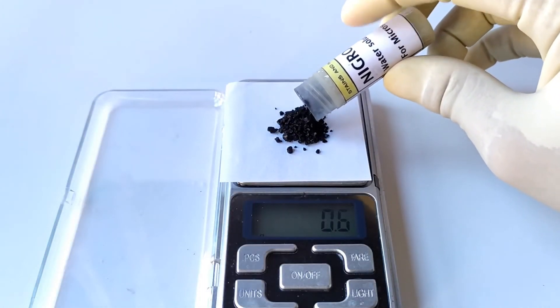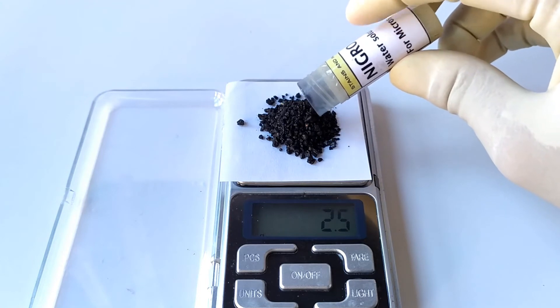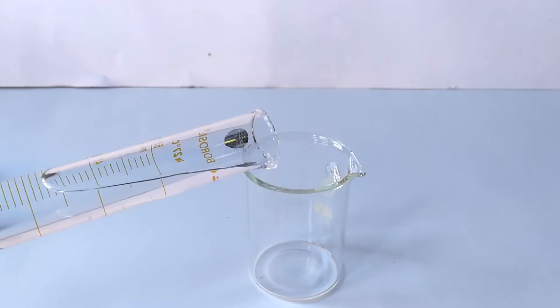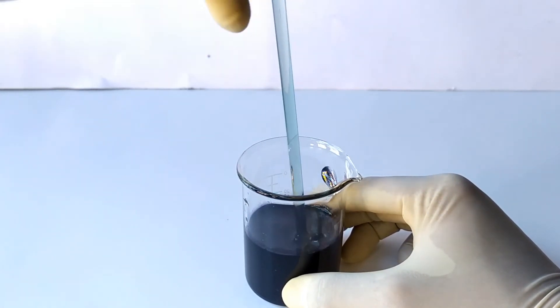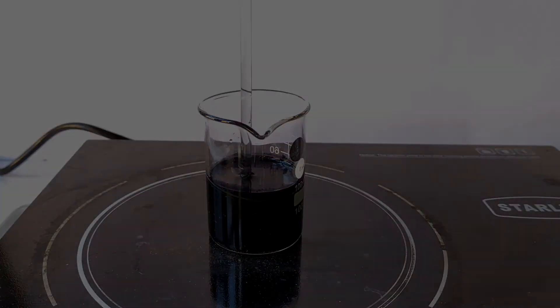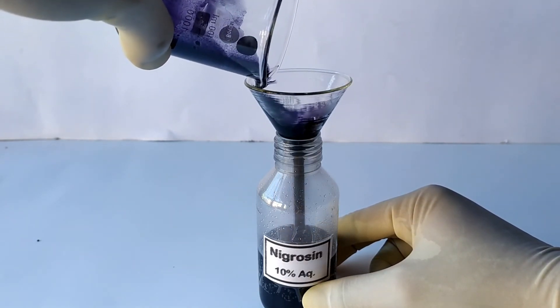Now prepare 50 mils of 10% nigrosin stain. Weigh approximately 5 grams of nigrosin water-soluble stain powder on a weighing scale. Transfer the stain into a beaker containing 50 mils of distilled water. Stir the contents until the stain is completely dissolved. In the case of nigrosin stain, heating the contents of the beaker to about 50 degrees Celsius will speed up the dissolution process. Once the stain has completely dissolved, allow the solution to cool down and transfer it into a clean, dry bottle for storage. Give appropriate label to the container.